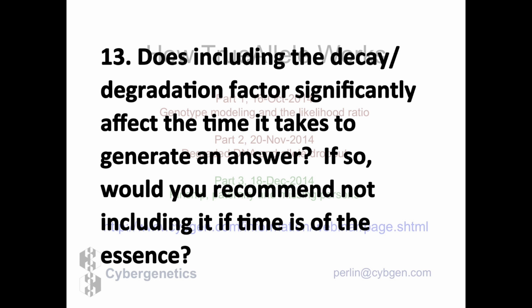But when there's an important case, and it falls in that 5% of cases where you just want to get more information, typically for a minor contributor, say a handgun that has 4 people on it, it's all very low level and it's all kind of mixed together. If it's an important piece of evidence, it's an option that you have that lets you do more with what you have.